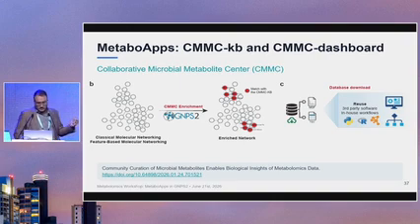And the workflow for the data itself was basically to perform classical molecular networking, feature-based molecular networking for all of this data. And then you can provide CMMC enrichment, and that's basically what you're going to do to your own data too, as we're going to see in a bit. And then you're going to have a rich network.